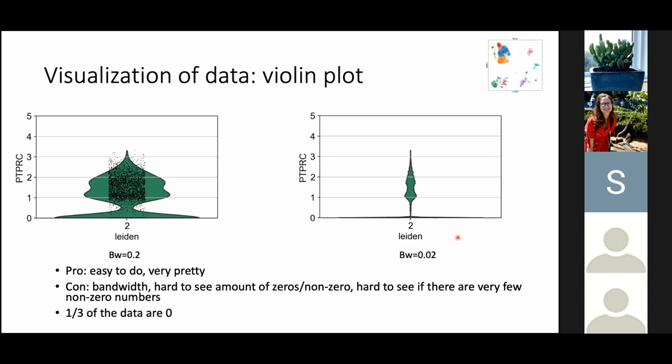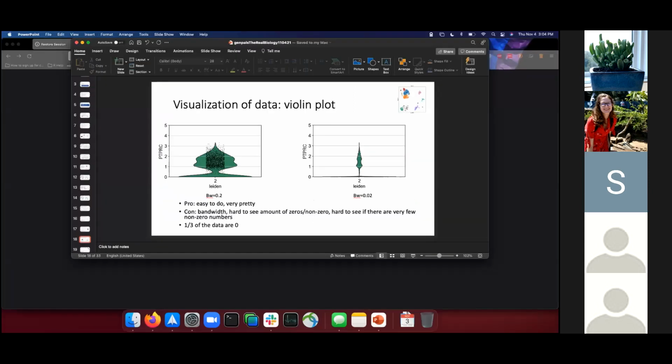So basically, you're suggesting all the zeros are a biological interpretation, that the transcriptional program is inactive in that cell, since every cell only expresses a very small subset of genes.